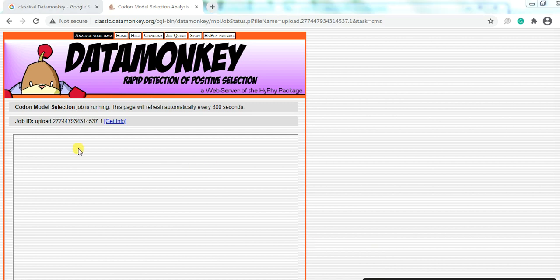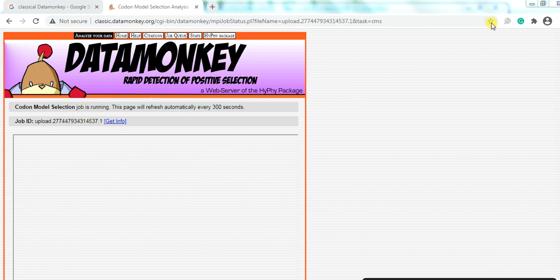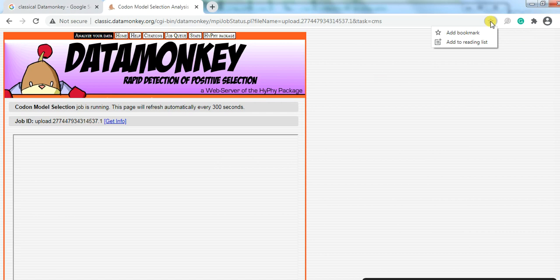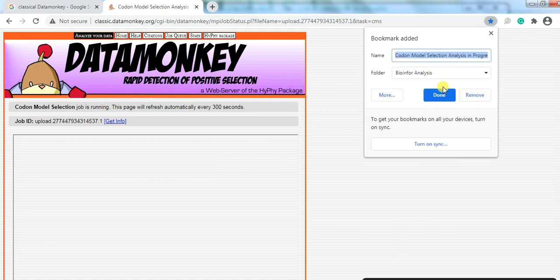When the job starts, a window appears saying 'Codon Model Selection job is running — this page will refresh automatically after every 300 seconds.' This analysis will take approximately 10 to 12 hours, or even more, depending on the number and size of the sequences. It is better to bookmark the page and save it.